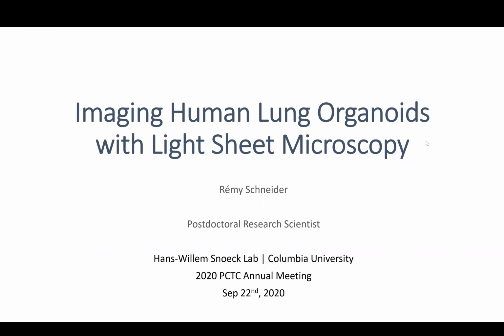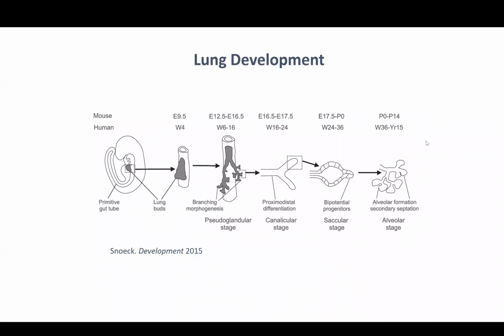And today I'll be discussing the imaging of human lung organoids with light sheet microscopy. So first, a bit on lung development.